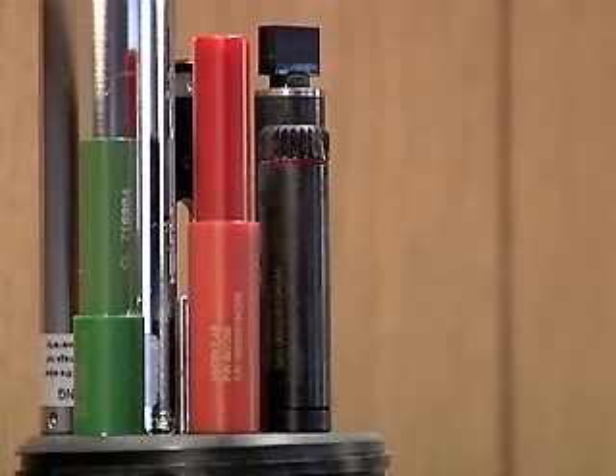Between the sample water and the ion solution inside the sensor is a membrane that reacts selectively with the specified ion. Other ions in sufficient concentrations can interfere with the readings, however, so these sensors should not be used in saltwater environments.